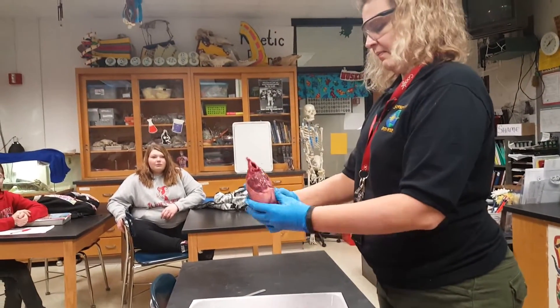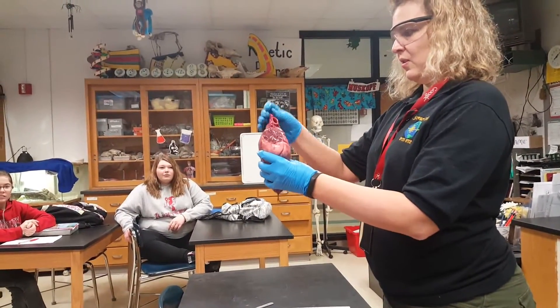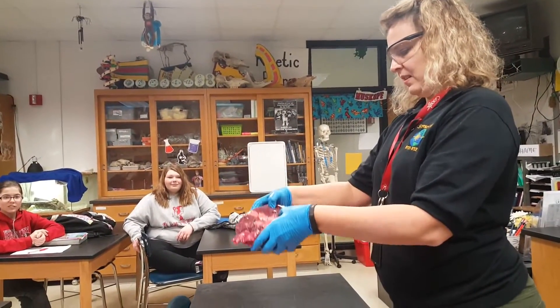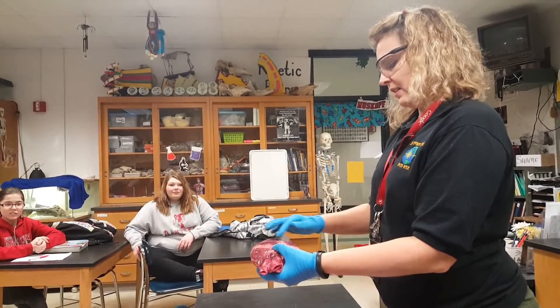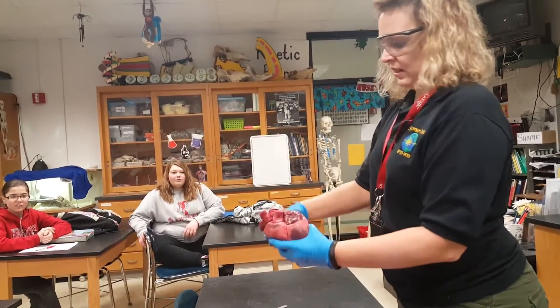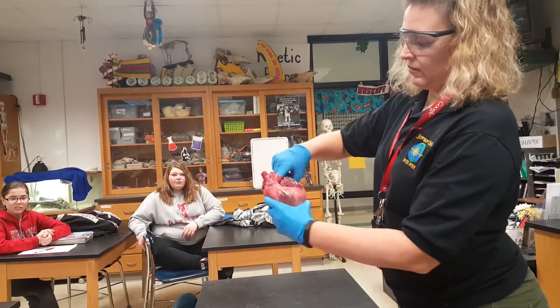Compared to the heart you guys had, it's got some cuts in it. I'm going to guess that when he took it out, he probably cut it a little bit. But we can see this top vessel right there.